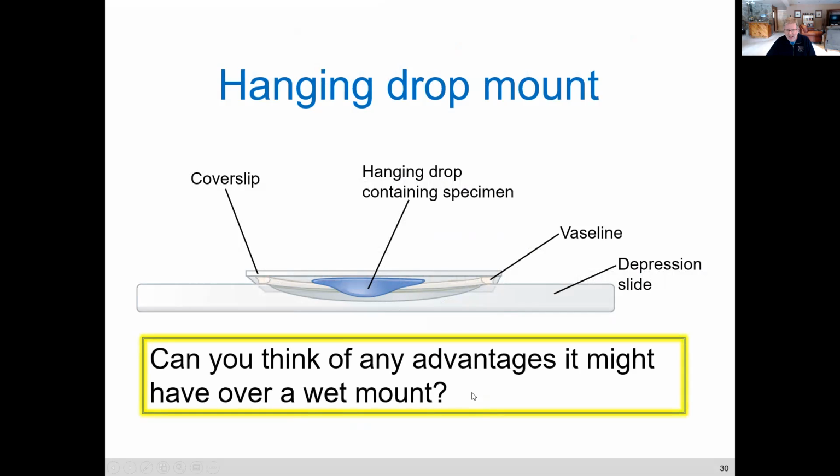And the purpose of using wet mounts, you might say, what's the difference between wet mounts and hanging drops? Well, the hanging drop slide has the advantage of allowing you to see more natural movement of organisms, let's say protozoa, maybe single-celled pond critters, in that drop of water, because there's no pressure being applied to them. With the wet mount, remember, you have the cover slip pushed down onto the slide, so the organisms are sort of getting squished a little bit.